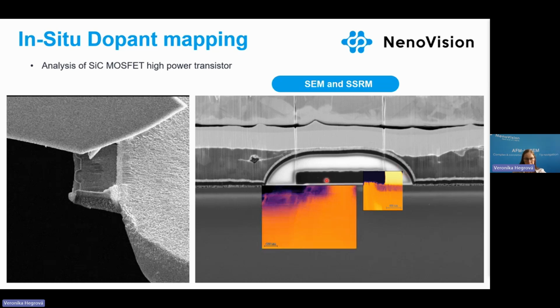One part, then we analyze directly below the transistor to see the shape of different parts of N, N and P. And we can do several transistors. We can see if it's repeatable or not. And depending on different connection with the sample, we can analyze different parts of the implants.